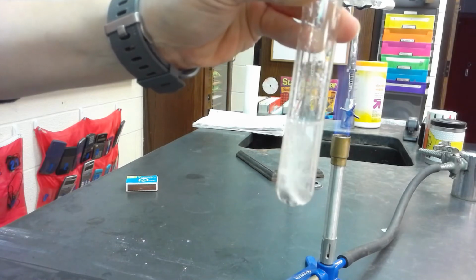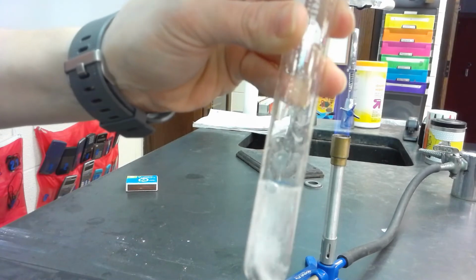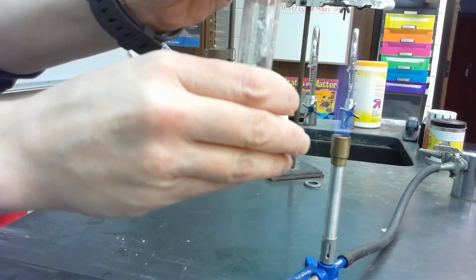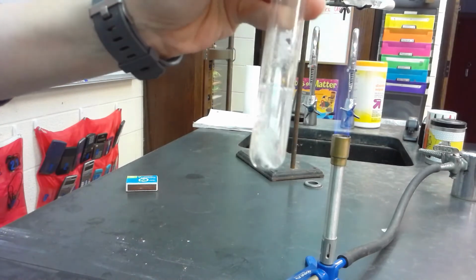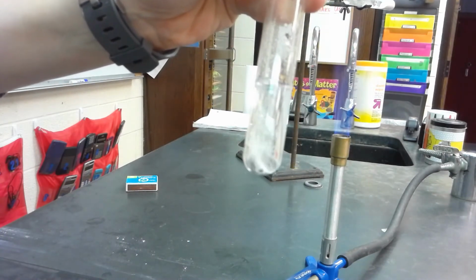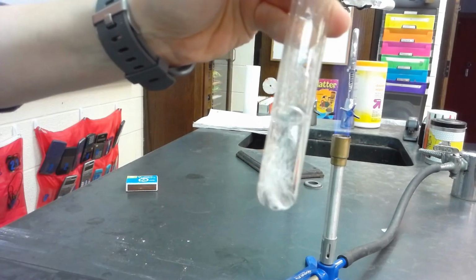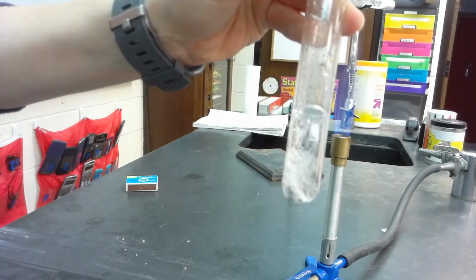There's a lot of bubbles that are being produced here. So that tells us that there's definitely a gas that's being produced. And it is also getting warm. I know you can't see that on the camera, but there is definitely some heat that is being put off here. So we have a gas being produced, and we have some heat being produced from this reaction as the zinc happily bubbles away. And we just need to wait for a minute. So we're just going to wait and watch.